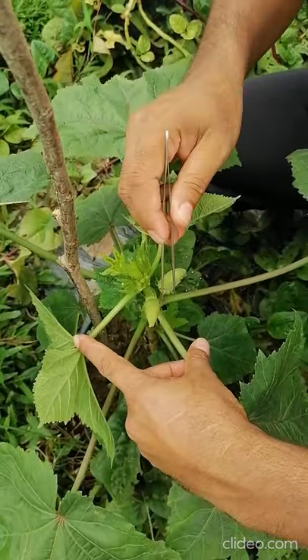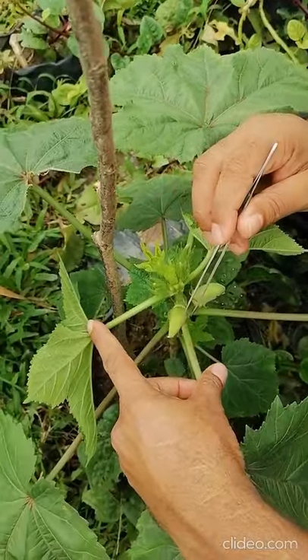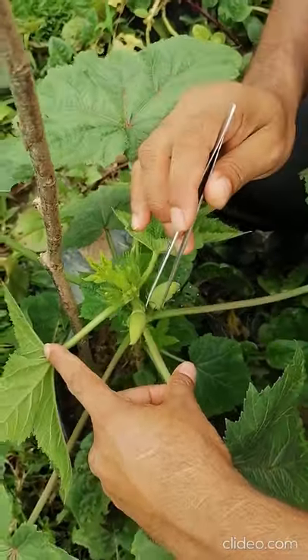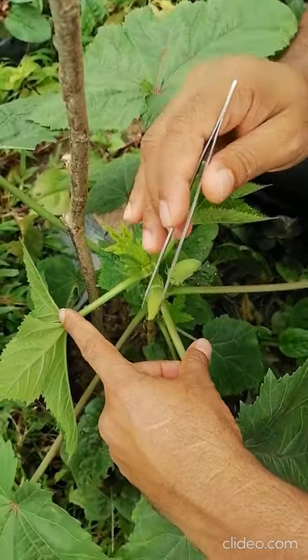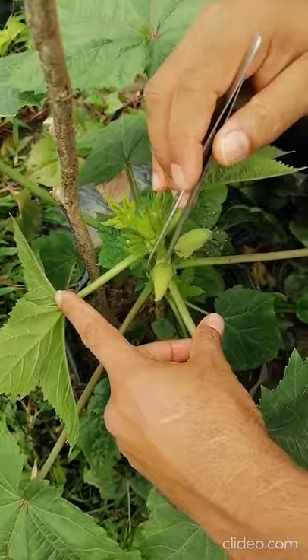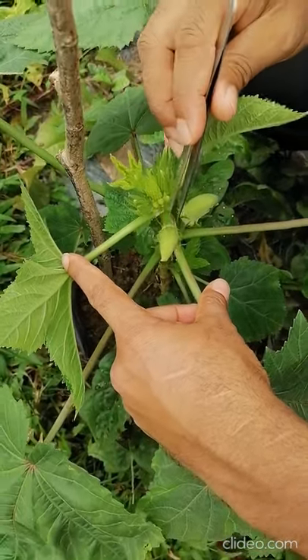This is the unopened flower of okra. This flower is supposed to open tomorrow morning, so today at afternoon time — 4:30 to 5 or 5:30 — you have to emasculate for the hybridization purpose. You have to emasculate first.